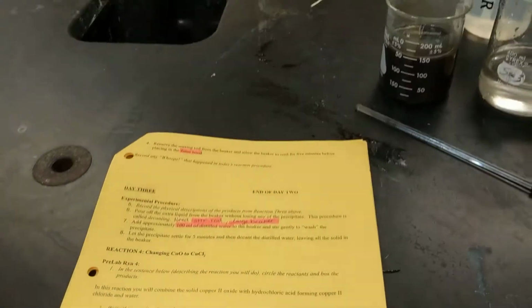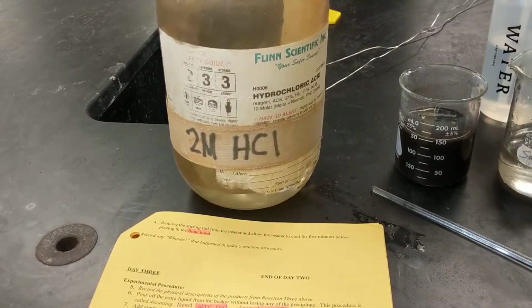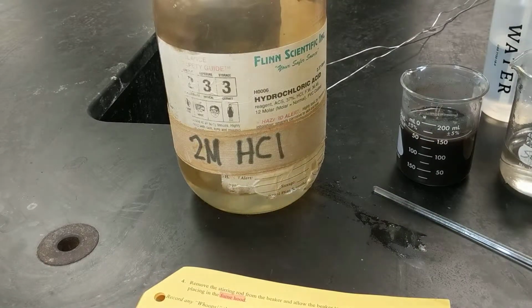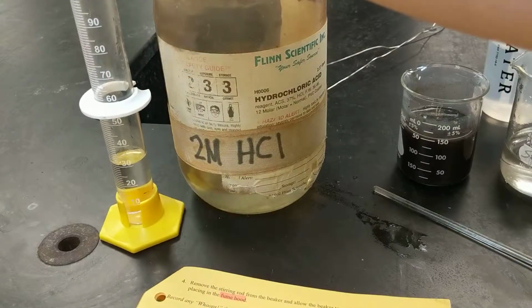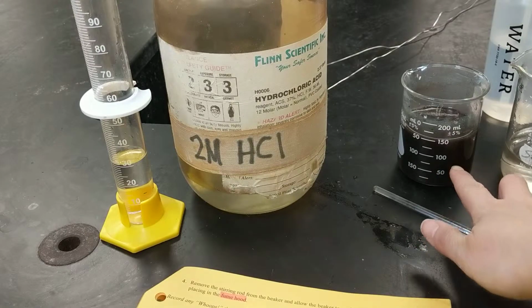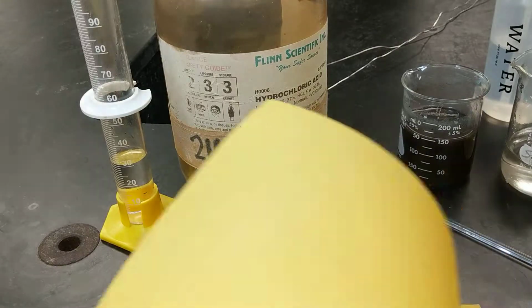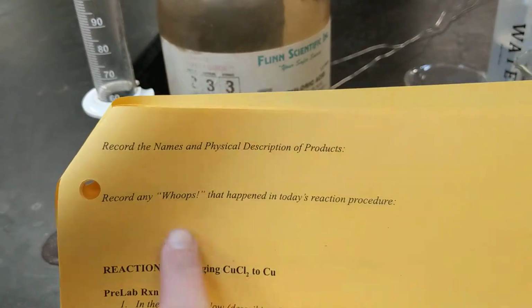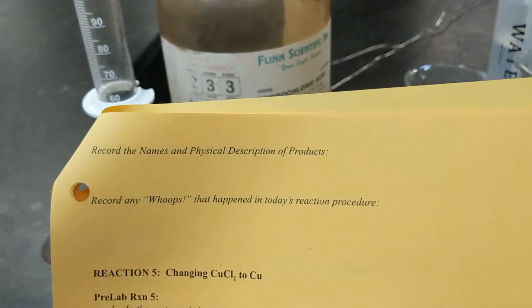So in the hood, again, you will find our hydrochloric acid. That'll be in our bottle here, and I'll have it in a beaker for you to pour into our graduated cylinder, right? And so I'm going to fill it with 30 milliliters. That is going to get added to the solid copper oxide, so this will have been decanted, and just the solid will be at the bottom, and I will swirl it. Then I will record the name and physical description of the product, and also any chemical changes.